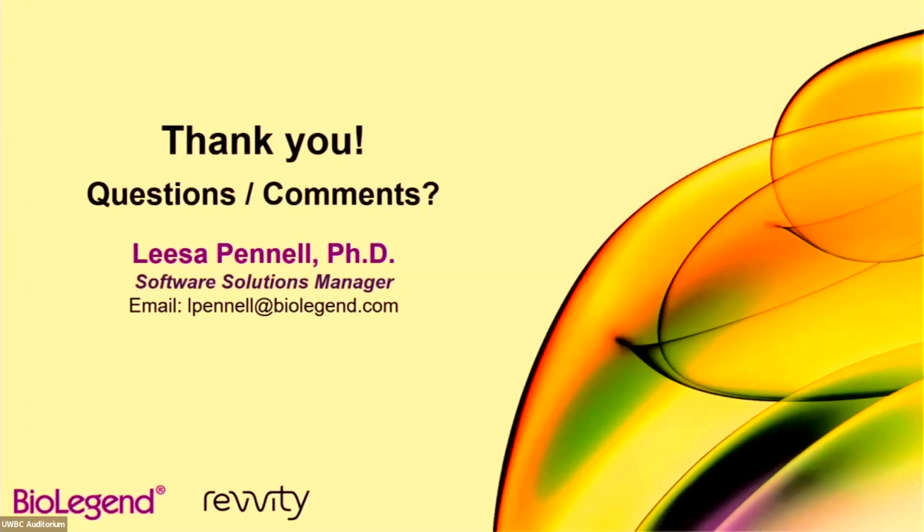And so in that case, what I would do is maybe do a test by flow first with the specifics you're going to stain with for the sort, and come in with a different color, same clone, if it has to be the same clone. Do a flow experiment and say, okay, if I label with PE and APC CD19, same clone, and I get to see both, right? If you lose one of them, then you know that you're oversaturating with one.